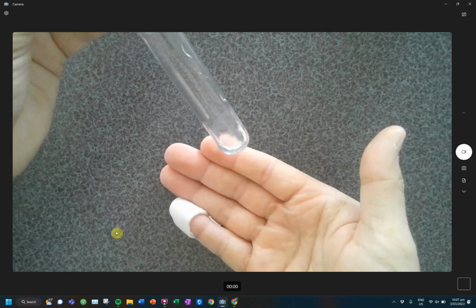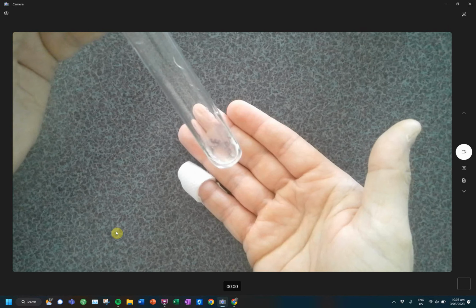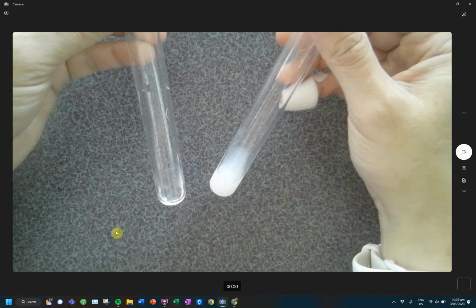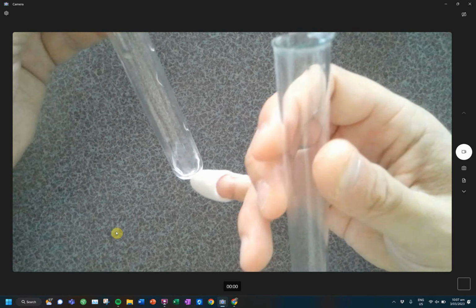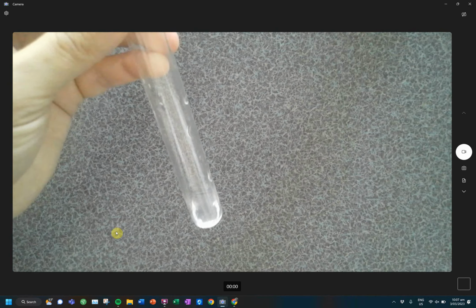And it's really hard to see right now. I'll point it on the document camera, and then I'll also walk around with it. But can you guys see that's a little bit opaque? Okay, good. So do I need to walk around? You guys okay? So you see how this one is opaque. So same step that I did here. This one, either aluminum or lead, I've added 2 drops, and I got a white precipitate. This one is also white, but it's kind of that more opaque color. So that would be one indication that I know it's potentially zinc.